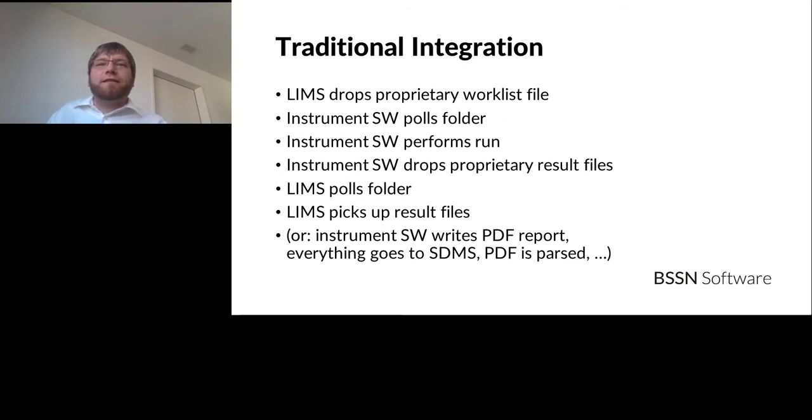Okay, so this will work, and then the LIMS goes, picks up the result files. This is going to be a different result file for every instrument, so I will have to configure my LIMS specifically to understand that file type and all of that. So that's one way of doing it.